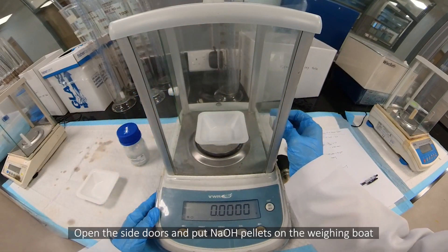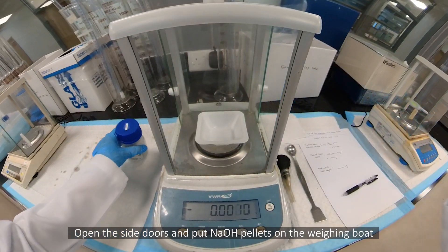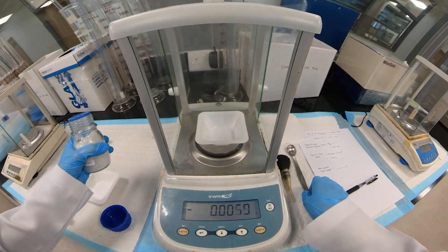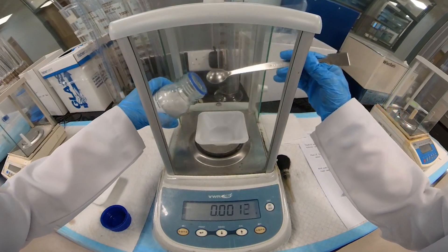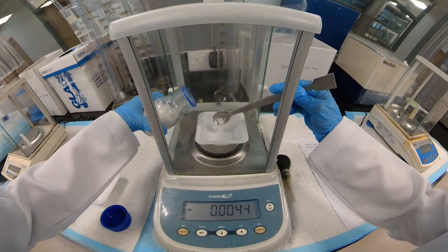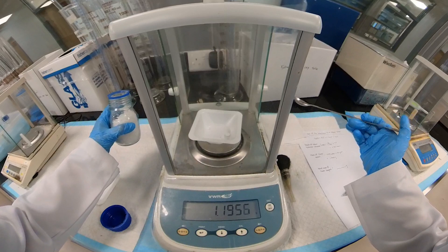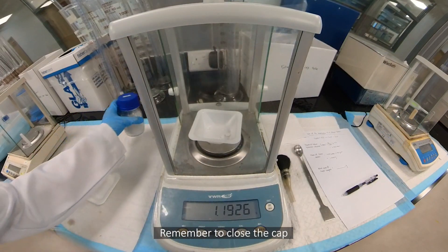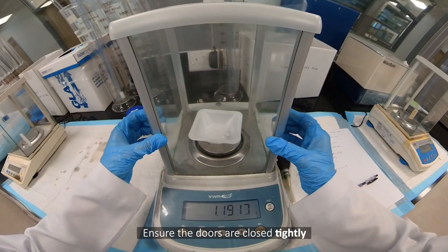Open the side doors and put NaOH pellets on the weighing boat. Remember to close the cap. Ensure the doors are closed tightly.